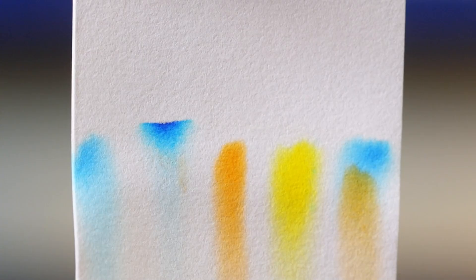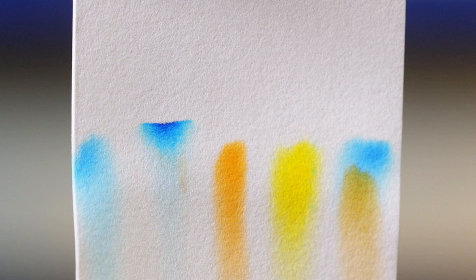However, we can see that the green food coloring is a mixture of a blue and yellow pigment. We can tell this because it contains two spots.